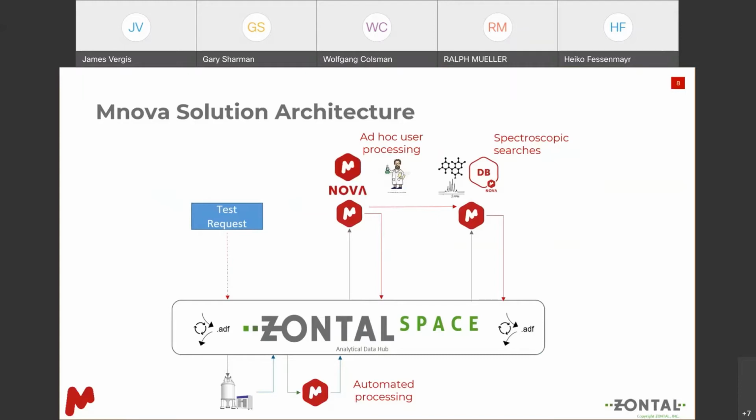And the other way that's supported is that obviously it would be fabulous if automatic analysis could cure everything and could deal with every piece of data, but that's not the case in the real world. So sometimes the scientist needs to look at that data, interact with it, and come to some conclusion, and then perhaps store the results.